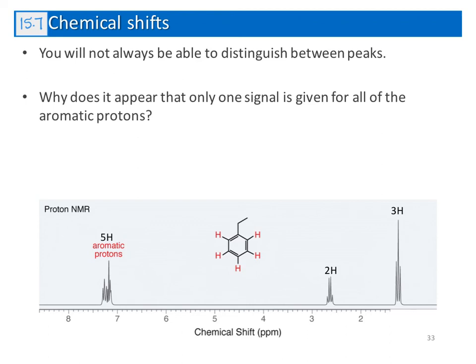Another important thing about benzene is that when you see a peak for aromatic hydrogens between 6.5 to 8 ppm with integration of 5, and this number is important, you can expect a mono-substituted ring as a possible structure for that spectrum. A mono-substituted ring is one in which one of the hydrogens is replaced by a substituent. So with 5 hydrogens in the aromatic region, always think about the possibility of a mono-substituted ring.